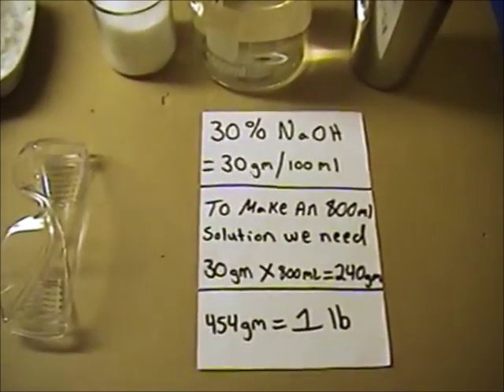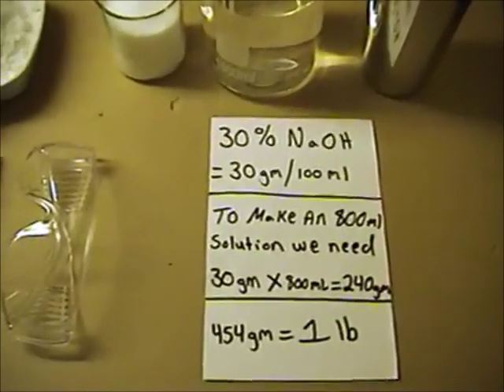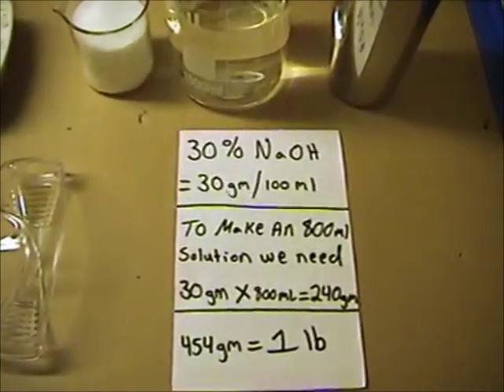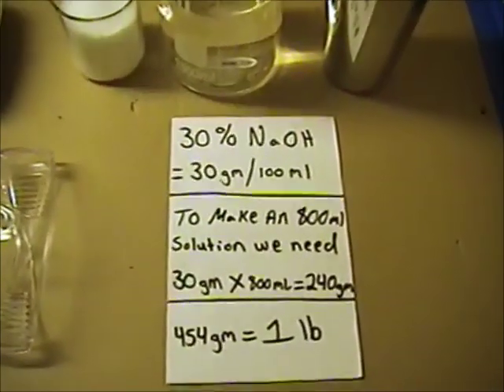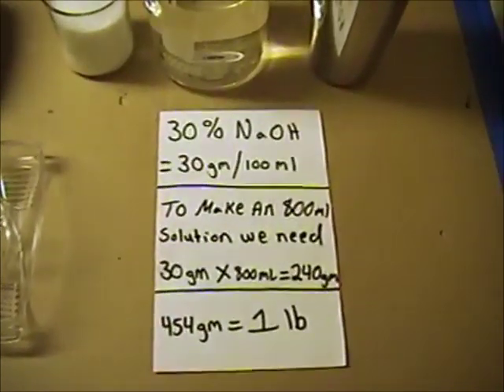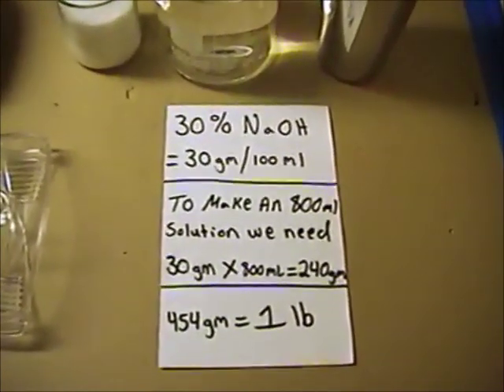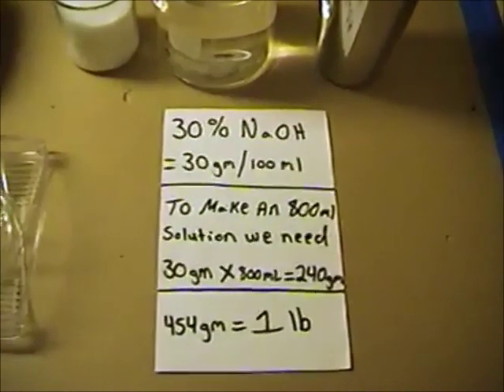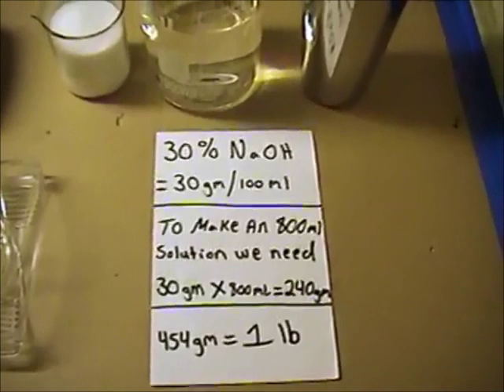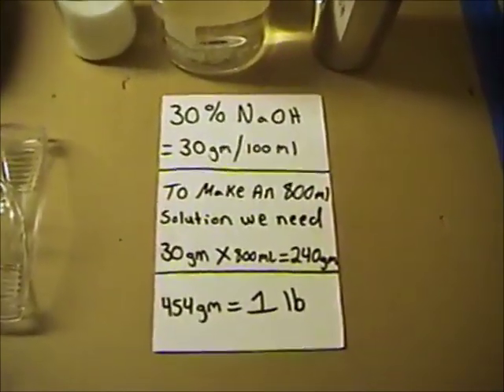But the good thing about this and the sodium formate is, if you mix up a large solution, you could store this in 3-liter Mountain Dew bottles, 3-liter Pepsi bottles. Any of those will hold these solutions. So what I'm going to do is make up an excess solution, because later on I'm going to perform some other experiments that I have in mind using this same system. So there's no use making up all these small amounts when I could just make it up at one time and pour it into a 2-liter bottle and just save it for later.